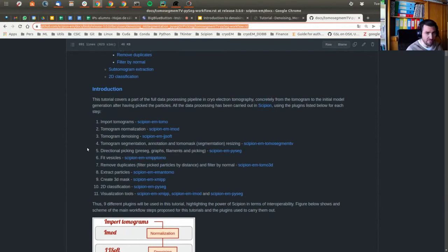Just a very quick overview, going back to the presentation. This is just to illustrate one of the main keywords regarding Scipion, which is interoperability. For this tutorial, there are three main plugins. JJSoft, as my partner said before, will be renamed as Tomo3D, and the current Tomo3D will also be renamed. This is due to an agreement with the author of JJSoft to provide a name which is more easy to be identified with his work.